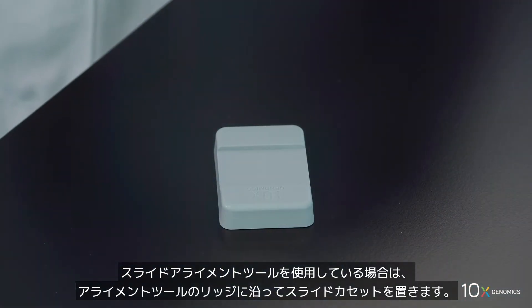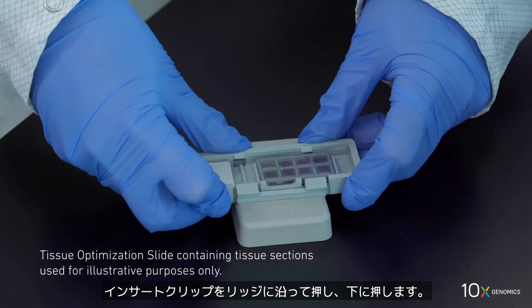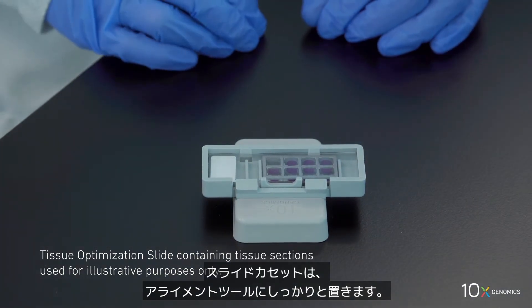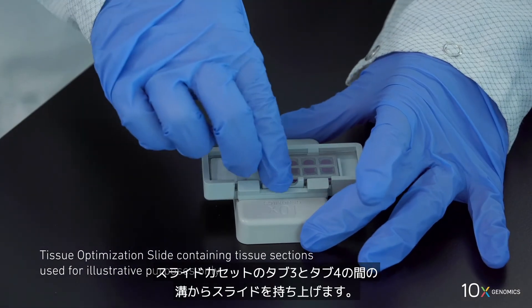If you are using the slide alignment tool, position the slide cassette along the alignment tool ridges. Push the insert clip along the ridge and press down. The slide cassette will sit securely on the alignment tool. Lift the slide at the slide cassette groove.